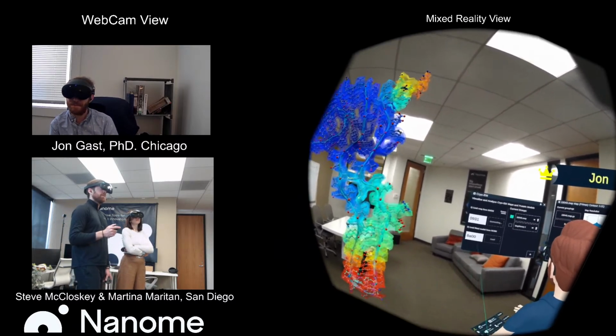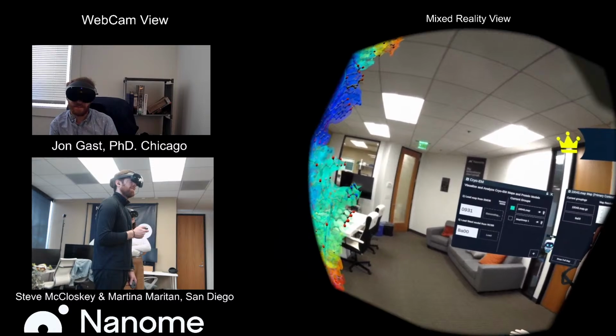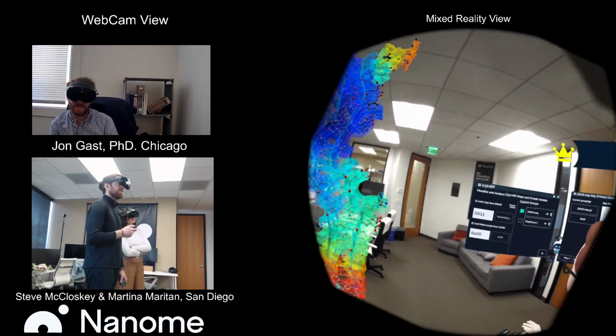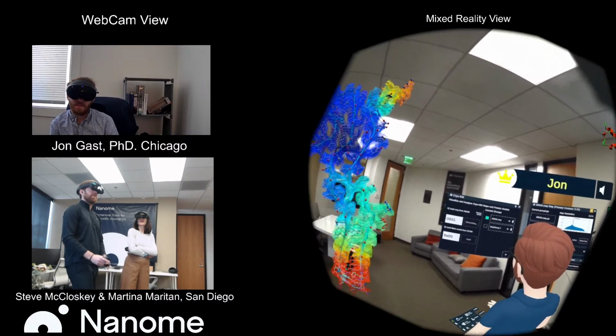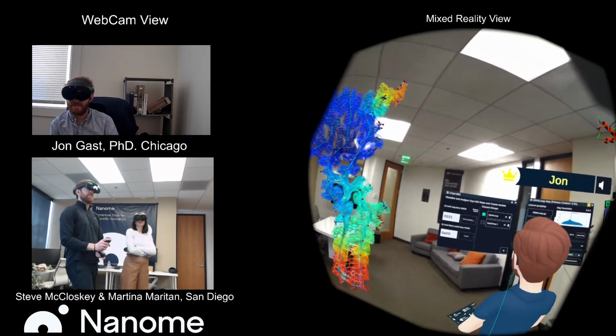We'll see if this loads in time for us to demonstrate the answer to the question, but yes, you certainly can. I was looking at that a second ago, and it looked like it was 250 megabytes, so it's going to take a little bit of time. But we could do other questions while that's loading.